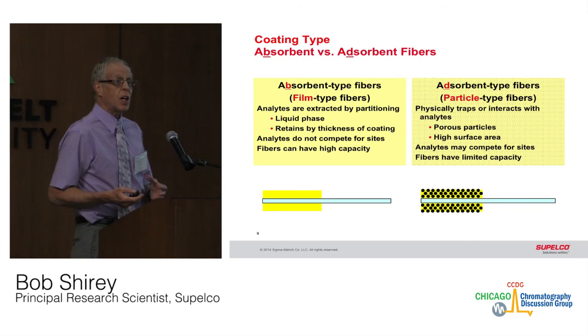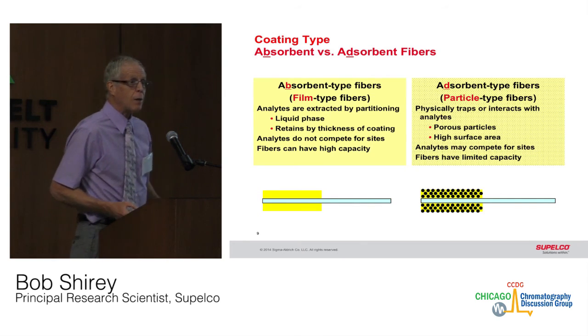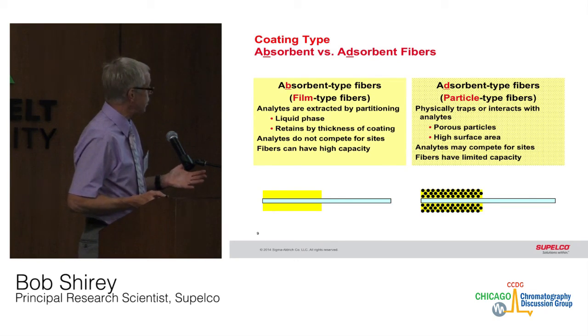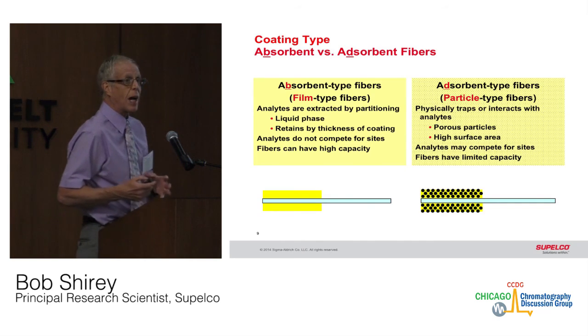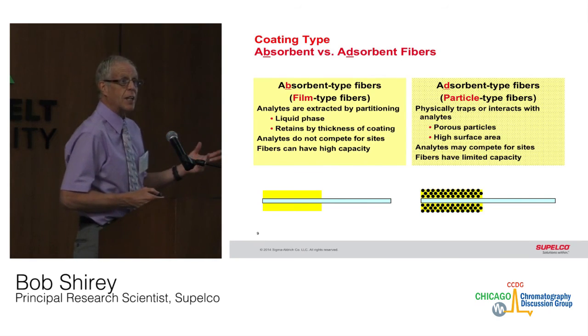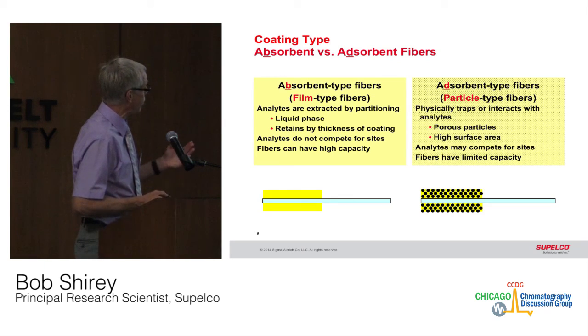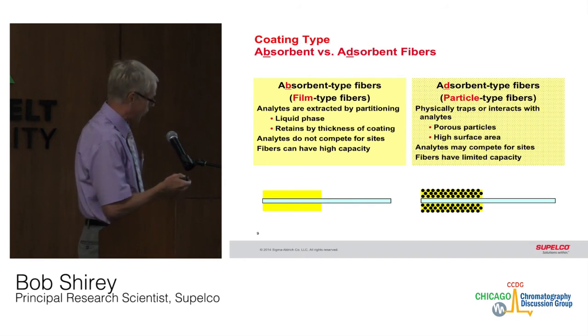Now, when you're classifying the types of coatings, there are absorbent coatings and adsorbent coatings. Absorbent coatings are just simple polymers such as a GC type phase, PDMS, or polyethylene glycol, and they retain the analytes basically by the affinity of that analyte for that coating versus the matrix, and by the thickness of the coating. Those are the primary factors. They do not compete for sites, and generally these fibers have pretty good capacity, especially the thicker coatings.